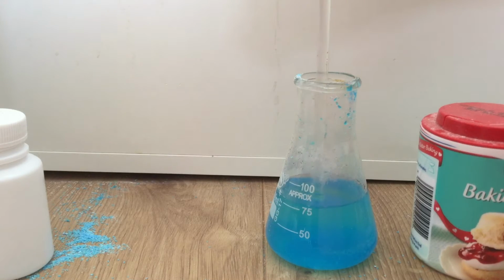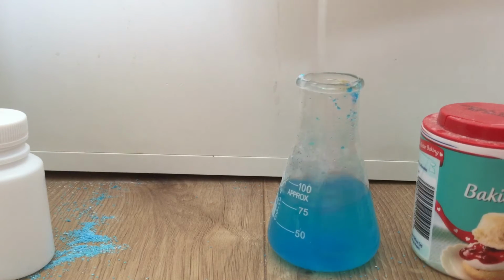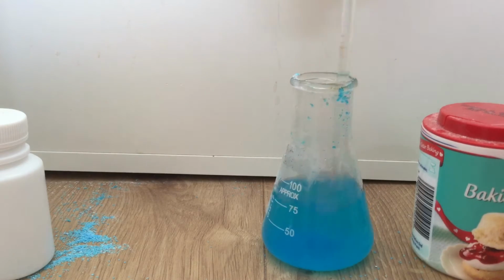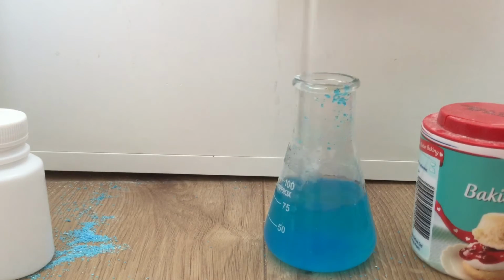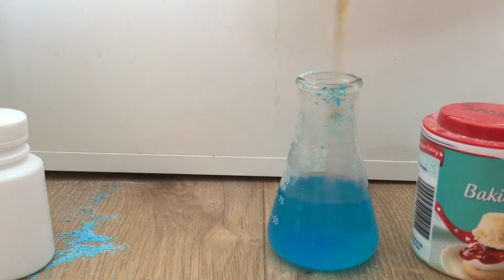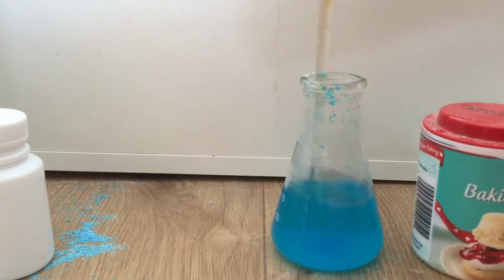But there is no bubbling. Well, there's a little bit of bubbling. Anyway, mix in the amount. If you've put in too much, it's not all gonna dissolve. Yeah, you will need to stir this for quite a long time. I'm not going to cut it, 1, because I don't have the best video editing software, 2, because it's easier to see how long it takes to stir.